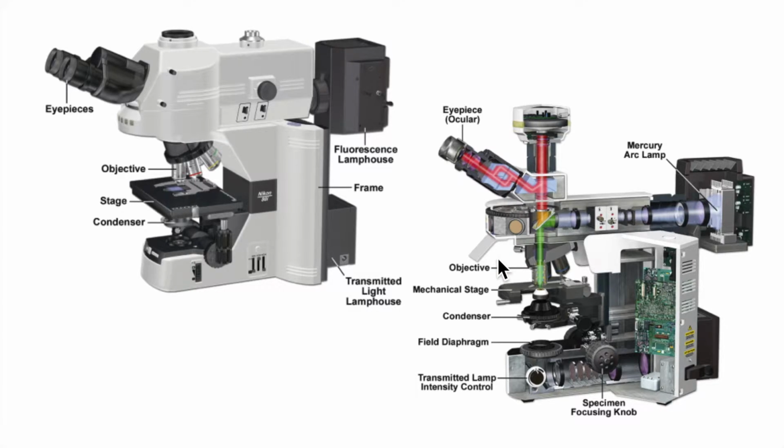All right, so when we talk about these different components, one thing to keep in mind is that there are two main types of light microscopes, and they really refer to what type of light is used to collect images. There's transmitted, where we have very thin transparent or semi-transparent materials, such as polymers, biological specimens, or just thin sections. And so we look at the light that goes through that material, and that's what's forming the image. So that's one type that we have.